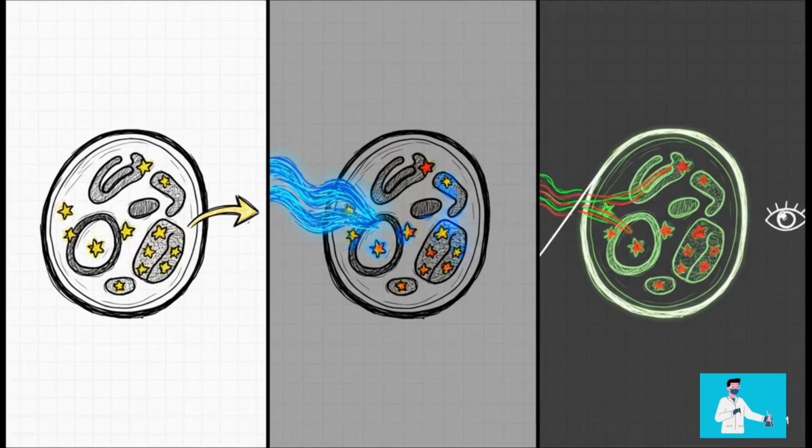So scientists took this idea and ran with it, creating fluorescence microscopy. They can design these fluorescent dyes that act like tiny beacons, and they attach only to the specific molecules they want to study, like a certain protein or a strand of DNA.